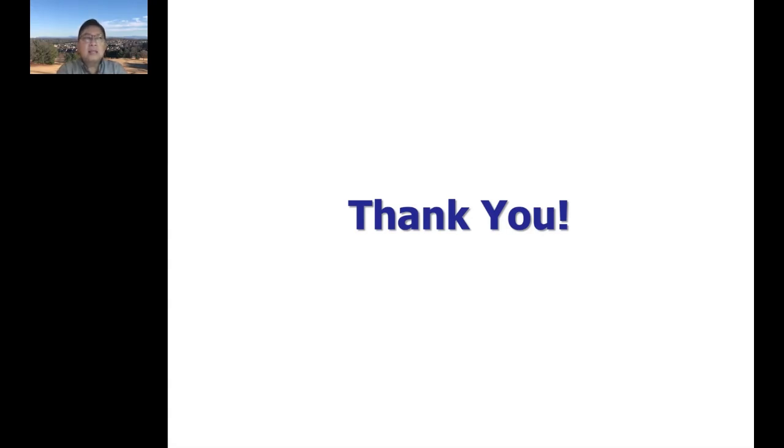Yeah, again, that's a very interesting question that dichotomizes what we have and can do in a national laboratory setting compared to an academic setting. So, in a national laboratory setting, by design or mission, we do science. We don't do as much teaching, although we do a bit of mentoring every summer. A lot of the laboratory resources can come from internal funding or external funding with the Department of Energy, and they're all designed on particular themes and capabilities. So, for example, this autoflow setup was part of an internal initiative to develop the laboratory of the future.